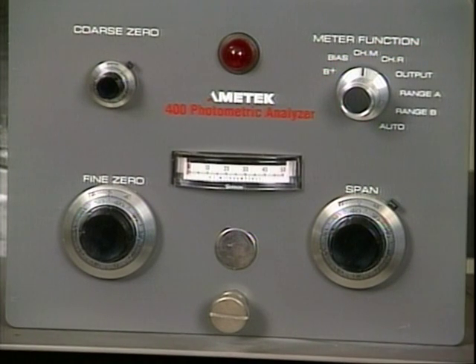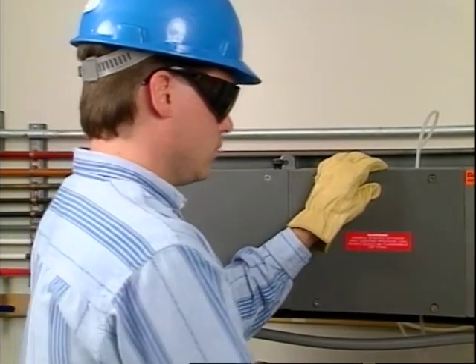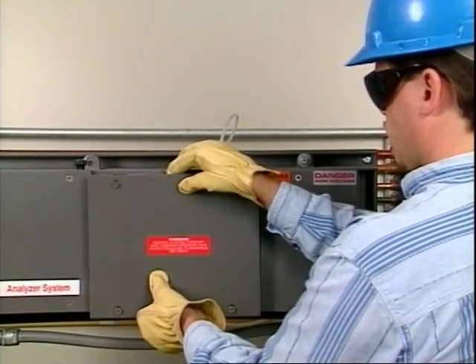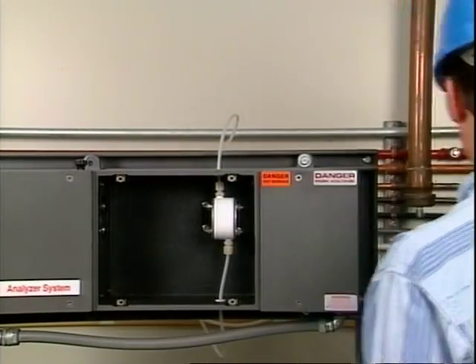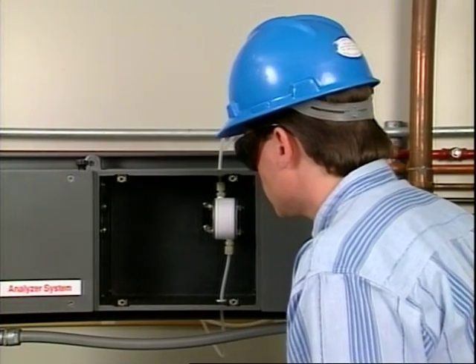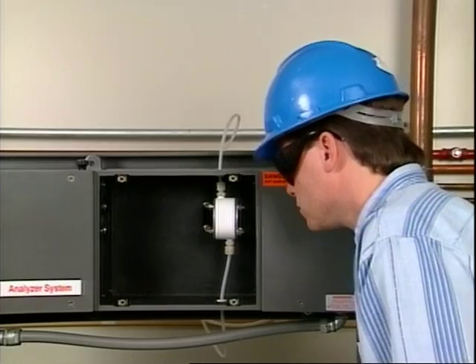If both channels read 0, check lamp operation by removing the cell housing cover. Avoid looking in the direction of the source. When working around ultraviolet light sources, be certain to use proper eye and skin protection. If there is no source lamp reflection, power may not be reaching the lamp.